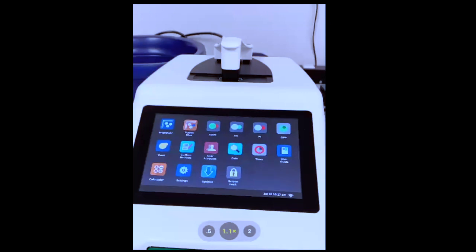Okay, so I'm loading the Trypan Blue sample, setting proper exposure, as we talked about, and focus.